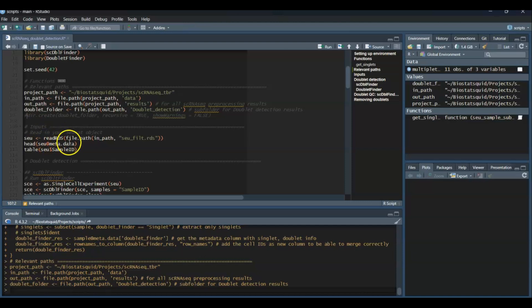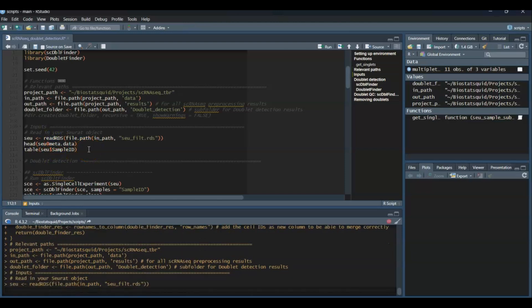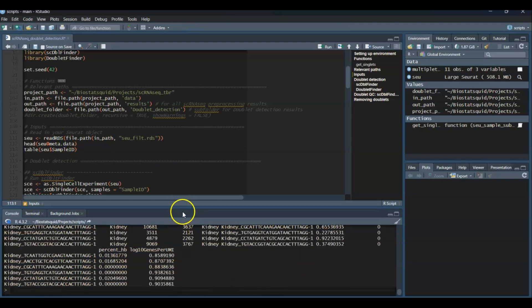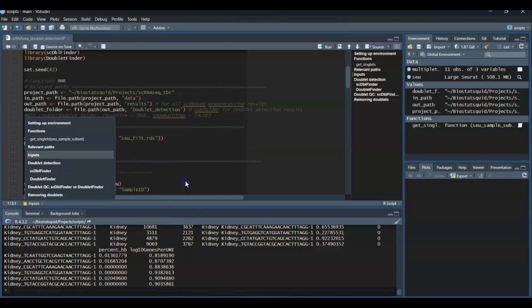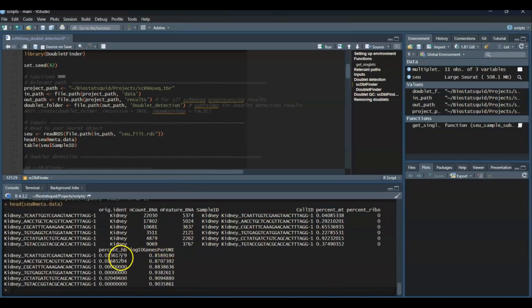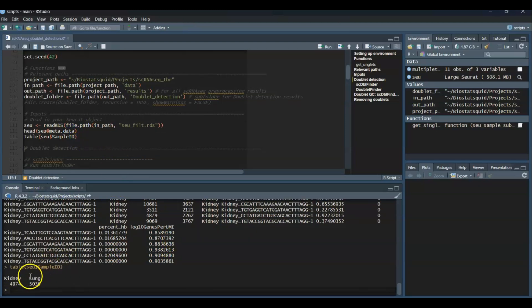Okay, so we'll start by loading the data. So we will load the Seurat object. As I mentioned, it's an intermediary Seurat object, which I already processed and filtered out low quality cells and genes expressed in very few cells. Let's have a look at the metadata. As you can see, there are two samples. These are all the metadata columns I have, and if we check out the sample ID column, there are two samples of cells from a kidney sample and cells from a lung cancer.